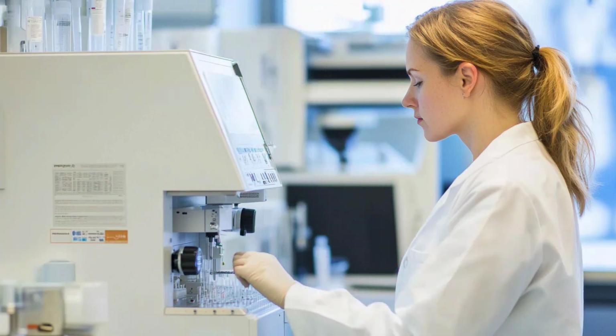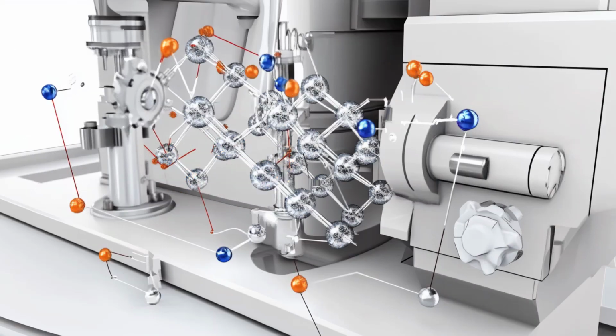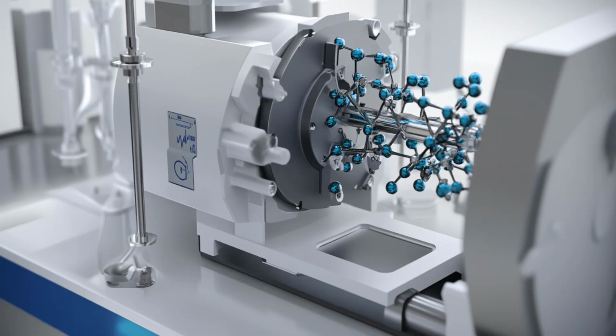This technique is indispensable in fields ranging from drug discovery, where it identifies pharmaceutical compounds with incredible precision, to environmental science, detecting trace pollutants in air and water. Whether solving crimes or exploring space samples, mass spectrometry opens a window into the invisible molecular world.